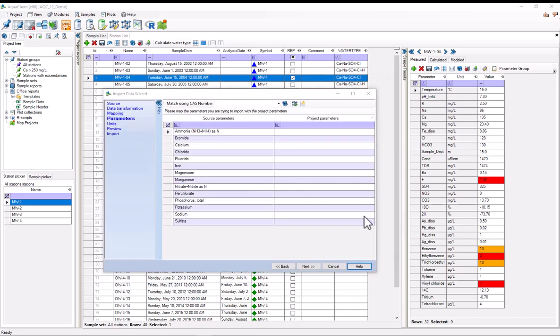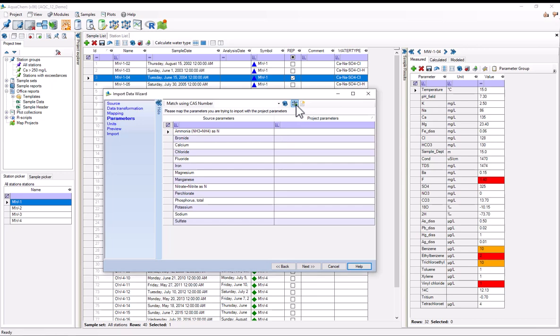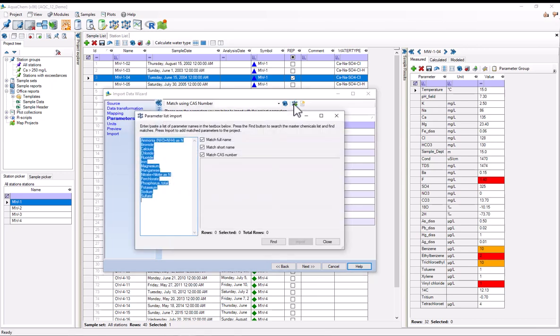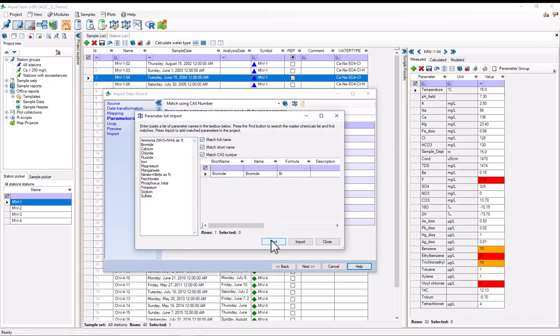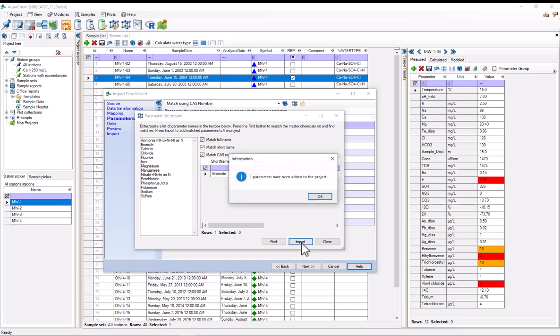Which takes us to the mapping step. In the mapping step, we'll map the parameters found in the imported spreadsheet to database or project parameters. Some of these we can map automatically. AquaChem comes with a large master chemical list. That is a large chemical database. And we might be able to add some of these from that. So to do that, you can press this little molecule with a plus button. Hit find. And we're able to get bromide. So I'll import that. It's been added to the project database.